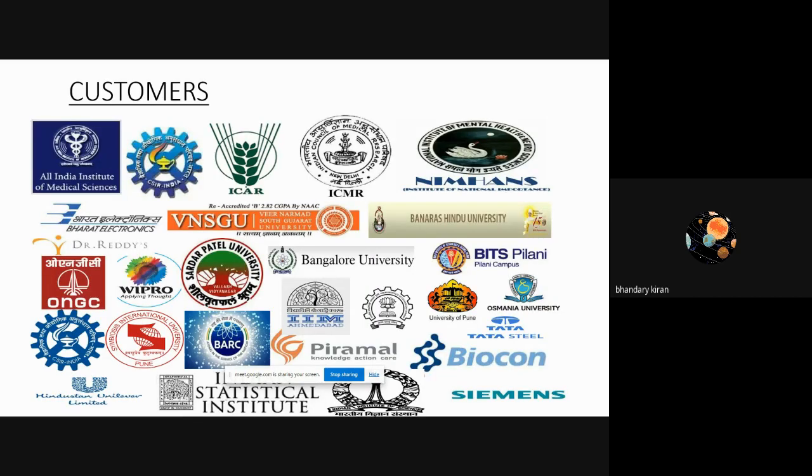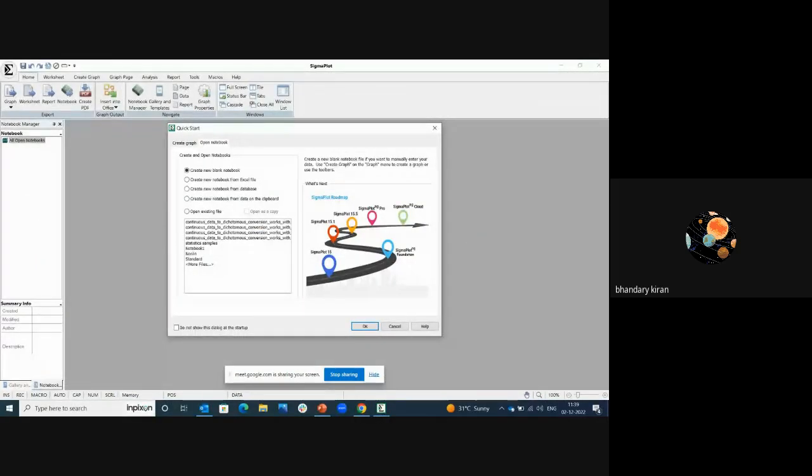And these are some of the customers of our software. And this is the overview of the software. Here you can see the quick start dialog box, which contains create graph and open notebook options, that I'm going to explain to you in the software part.